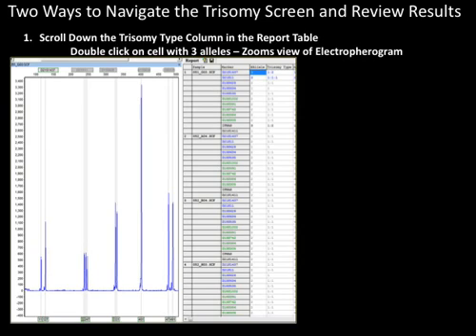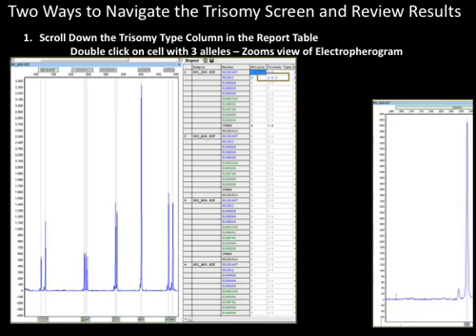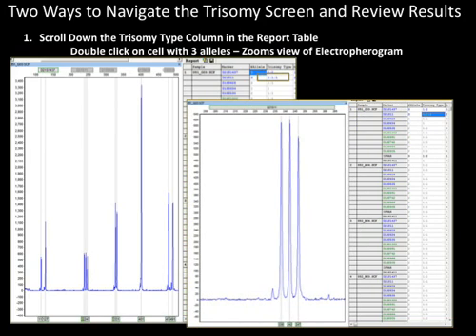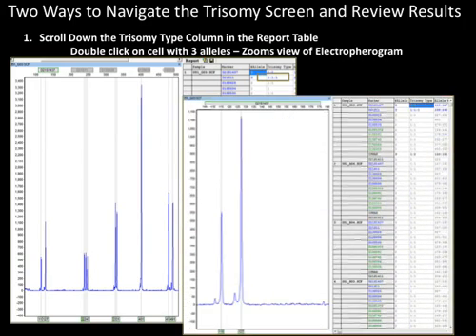There are two convenient ways to review results. Scroll down in the trisomy column in the report table and double-click on cells with three alleles to display a zoomed view of that marker in the electropherogram. In this example, we can see a triallelic pattern at locus D21S11 in sample O51. By double-clicking on the cell above, we see an example of a 1 to 2 trisomy ratio at locus D21S1437.